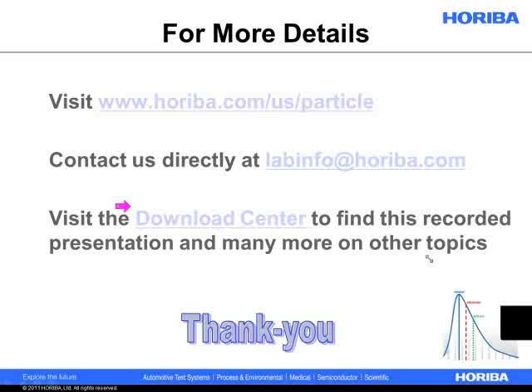One of the factors is refractive index. Another factor is how many times we run the scattered light pattern through the algorithm in an iterative manner. And both of those things affect how well the derived particle size distribution fits the original measured scattered light pattern.